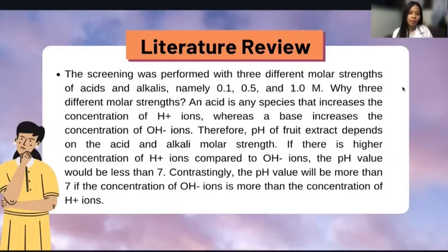Thank you, Farheen. Okay, back to the slide. The screening was performed with 3 different molar strengths of acid and alkalis, which are 0.1, 0.5, and also 1 molarity. Why 3 different molar strengths?